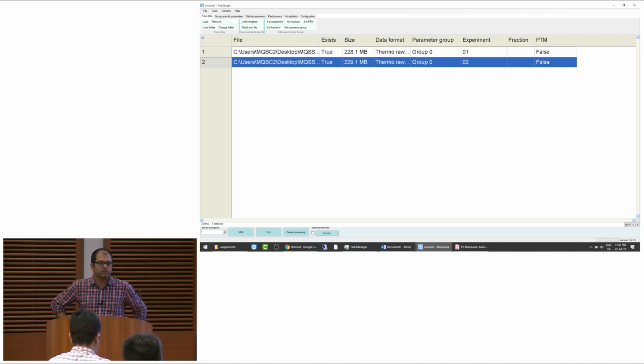Any PTM where you're actually interested in the quantification of PTM in comparison with the proteome. No, this is for the occupancy calculations. The occupancy calculations are done when you have phospho, for example. Let's say you have 5 files that are proteome files and 5 files that are phospho-enriched samples.